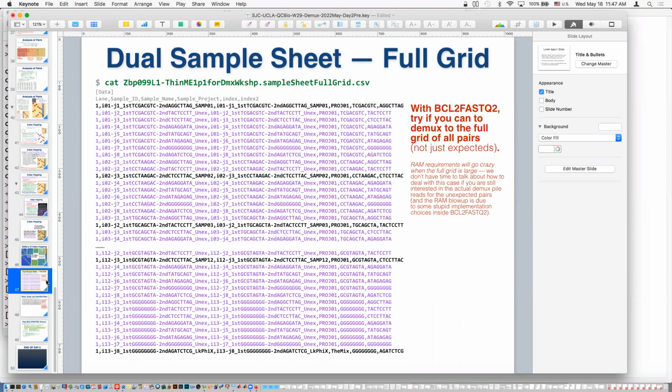I'm not going to have time today to say why that's bad. Yeah, you should basically try to always do Demux in one shot, for the reasons we talked about on day one: the mixture is not simple. When you cut a target file into pieces, you make it look simpler than it really is.